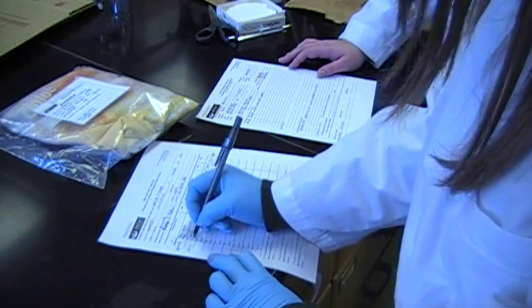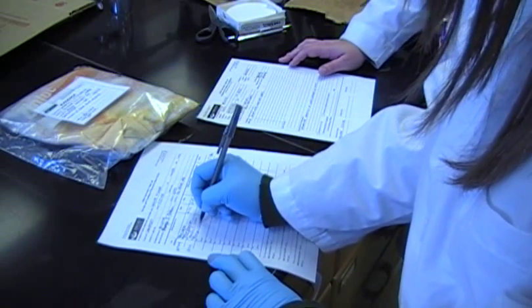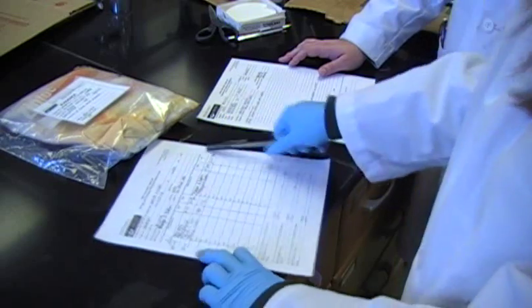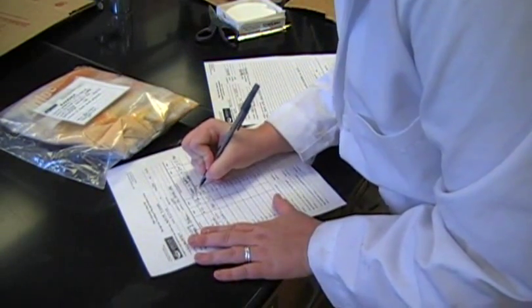These results can help determine who fired the gun and possibly where the person was when the gun was fired. Gunshot residue evidence is very important to investigating officers, and the lead test and the nitrate test are common procedures in any forensic laboratory.